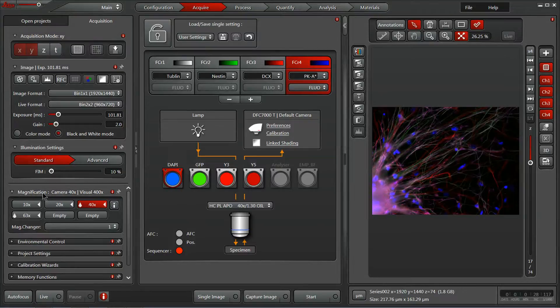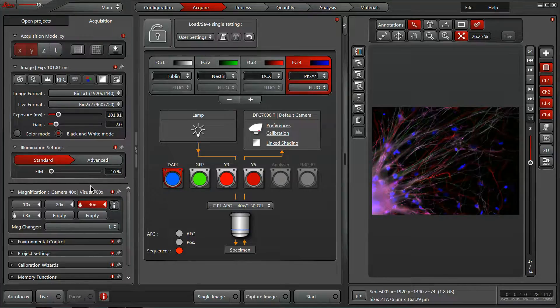We also have our magnification control. Since there's a motorized nosepiece on this microscope, I can click and change between different objectives. Some systems aren't motorized, but are encoded, in which case you'll be able to easily see your objective being displayed here, but you'll have to reach over to the scope and manually change them.